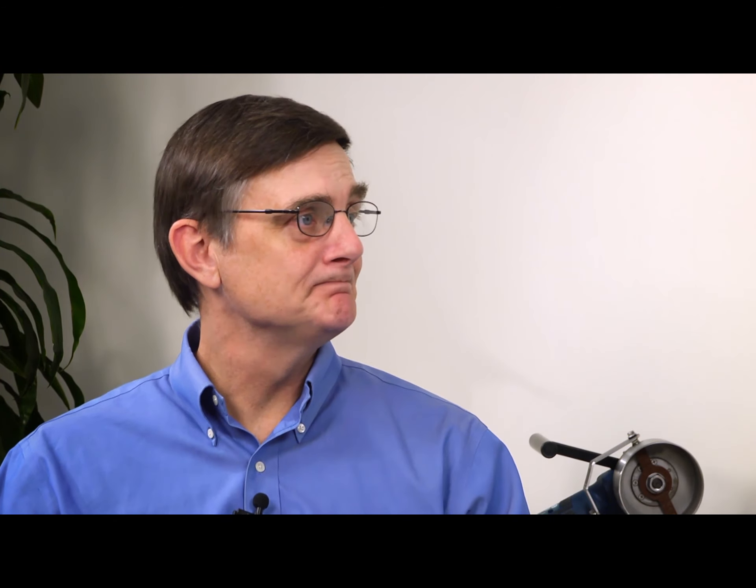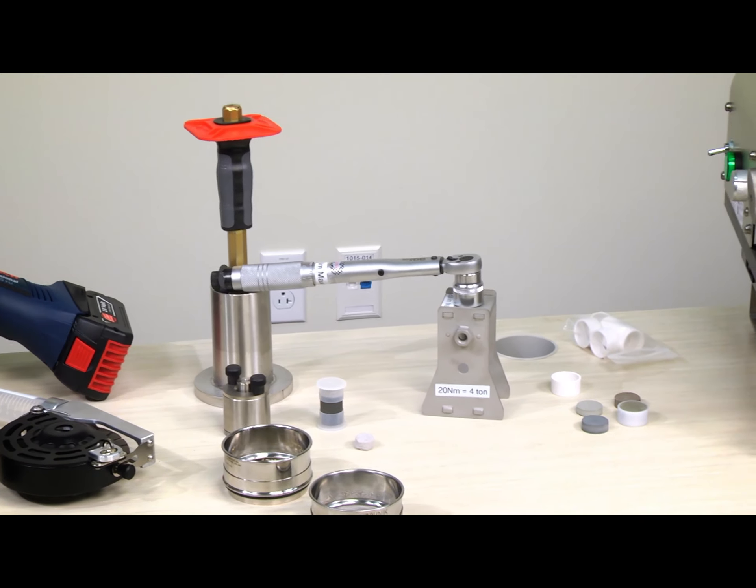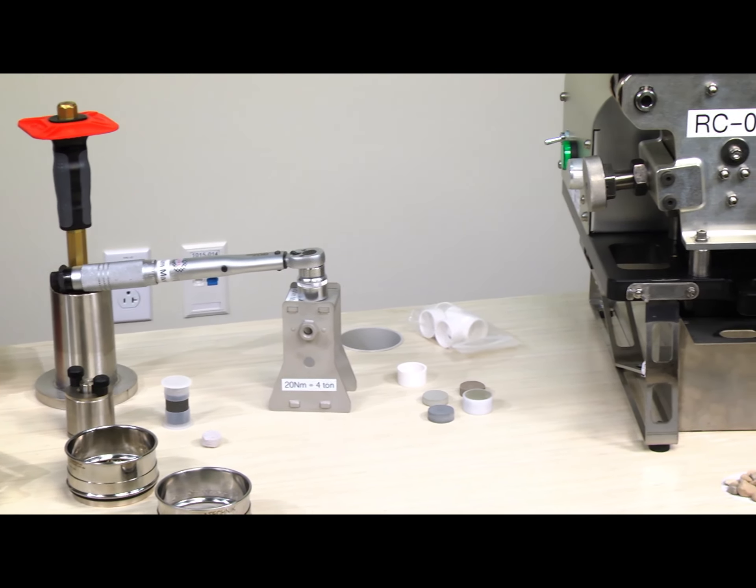Today, we're going to talk about sample preparation. So how do PXRF users figure out how much sample preparation they need to do? The level of sample preparation depends on the objectives of each individual user — it could be no sample preparation, it could be full sample preparation, and everything in between. We're also going to show some of this equipment that we have behind us, starting with really basic levels of equipment right through to quite advanced levels of sample prep.